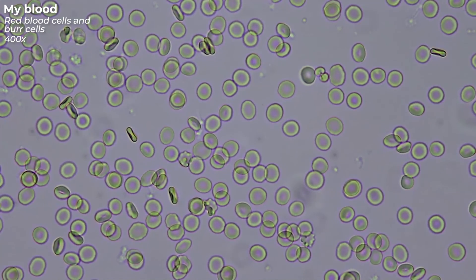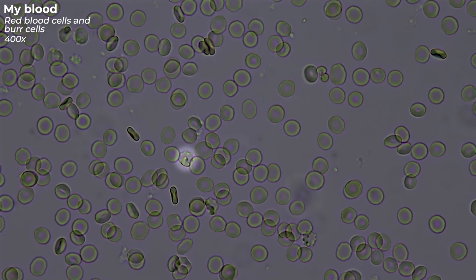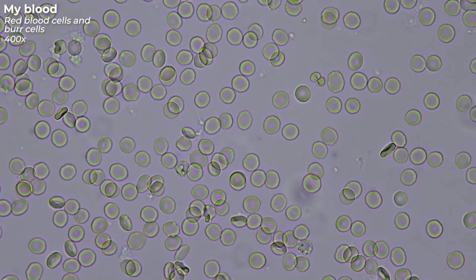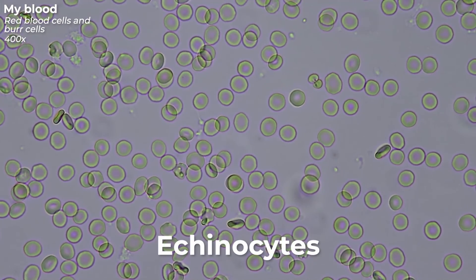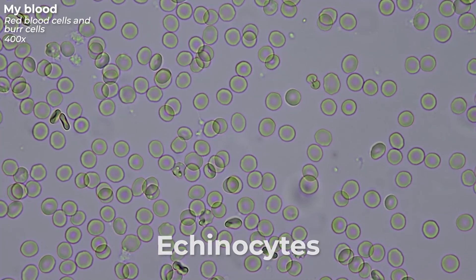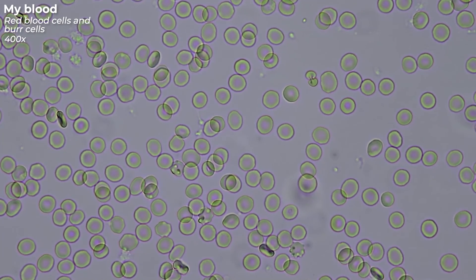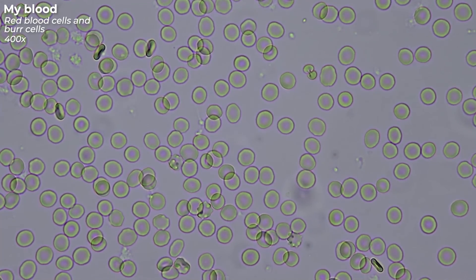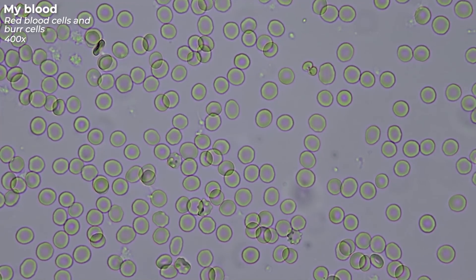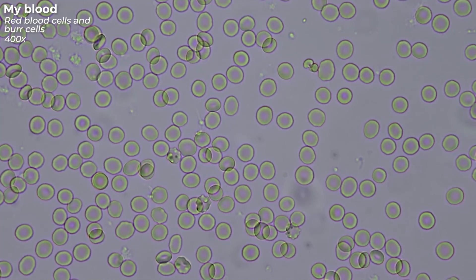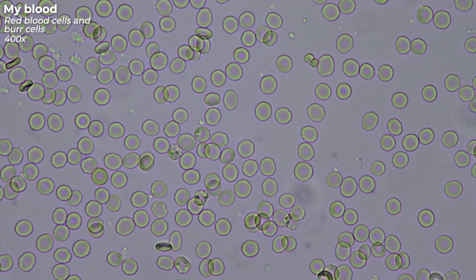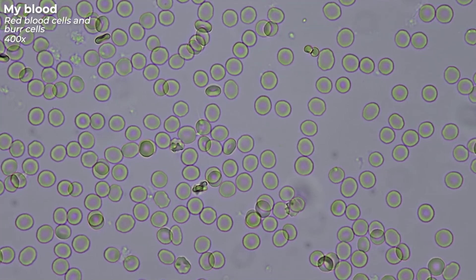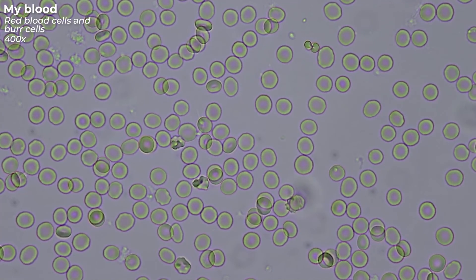Sometimes red blood cells, like this one, get a bumpy cell membrane. These cells are then called echinocytes or burr cells. The changed shape comes from the fact that the cell content shrinks, which means that water is flowing out of the cell. In my case, it looks like this because the blood is slowly starting to dry out on the slide. So nothing to worry about.